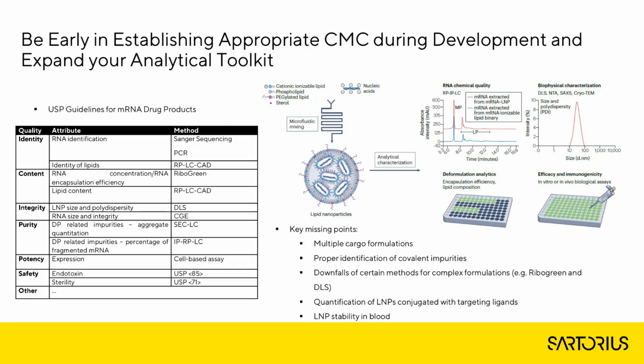Then you have certain downfalls of the existing methods for this type of formulation, where you have different cargos inside that you need to separate, where you have a higher heterogeneity, and you need a method to address that. That is where we will need to work on new methods.